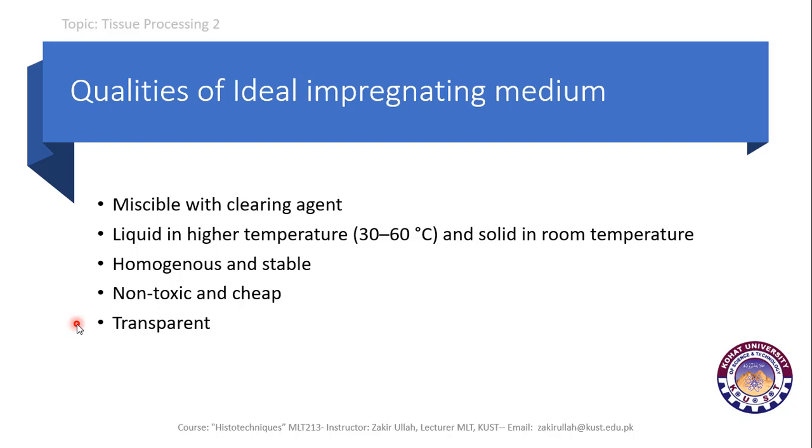And this impregnating medium should be transparent, because if certain chemicals disturb the transparency of the embedding medium, this will create problems during microscopy.